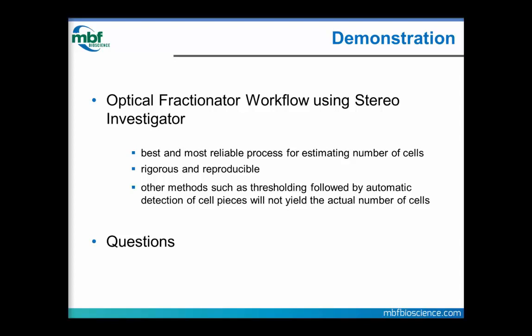This is a rigorous process. I am about to go over the set rules that we're going to use to do this. These are accepted rules. You can publish these rules in your papers. We also strongly suggest you publish 1 or 2 or 3 paragraphs about how you define your region of interest. You'll end up with a reproducible experiment that people can verify.